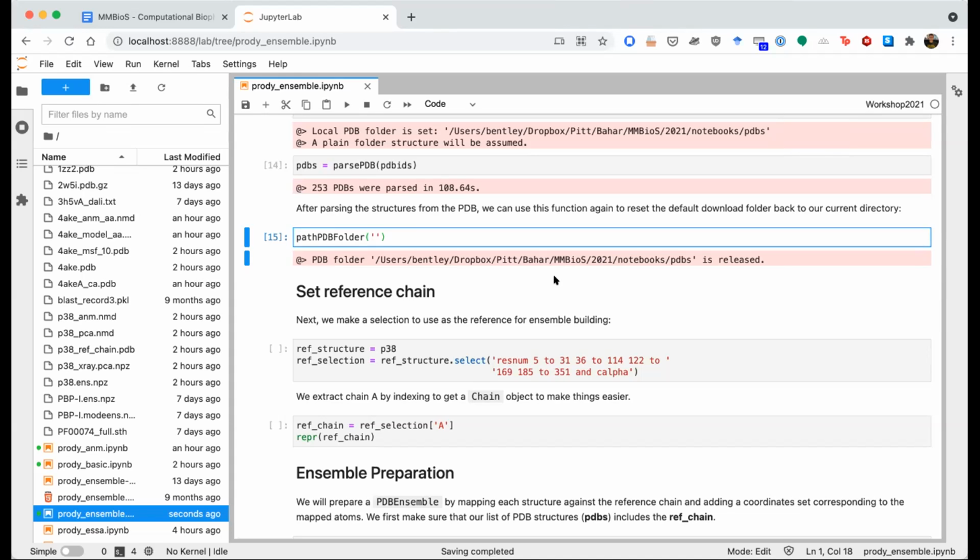In order to combine different structures, atom groups should be the same. Then you can evaluate principal components based not only on your simulation frames but also the X-ray structures. Then you can project all of them onto the PCs of this ensemble.